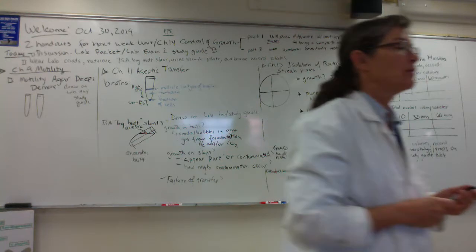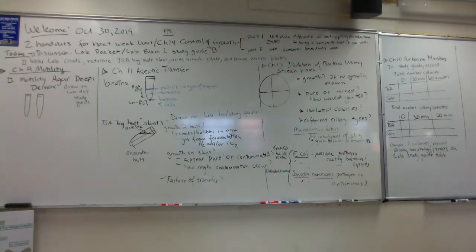Can I just take a peek really quick, you guys? Just look at somebody's plates really quick. Okay. Oh, there it is. There's a Micrococcus luteus, a little yellow guy. And the little guys here are Micrococcus. Yeah, so they form these little yellow colonies.